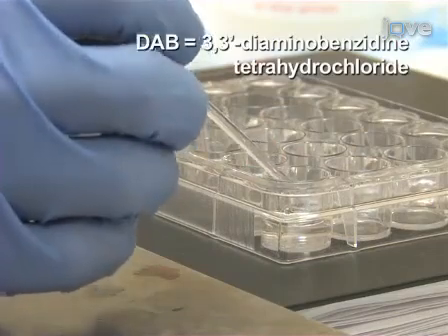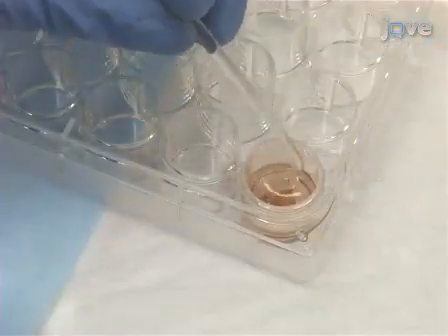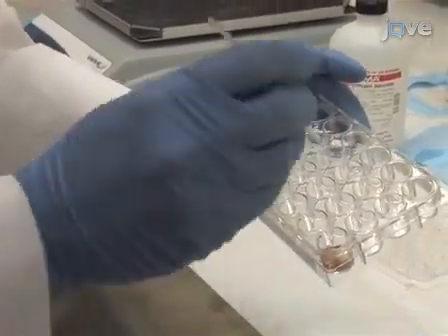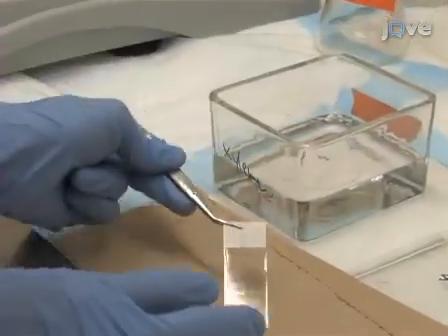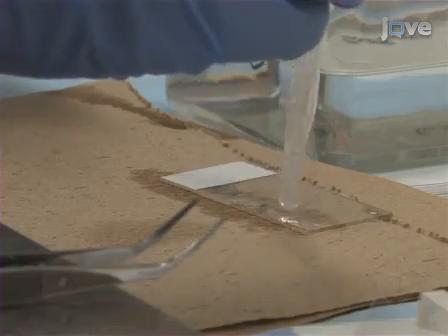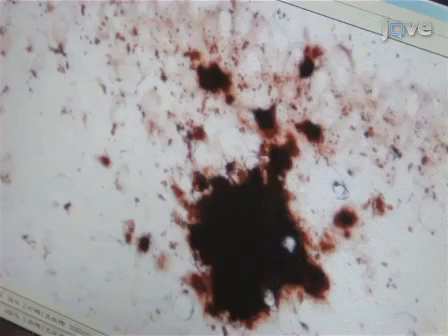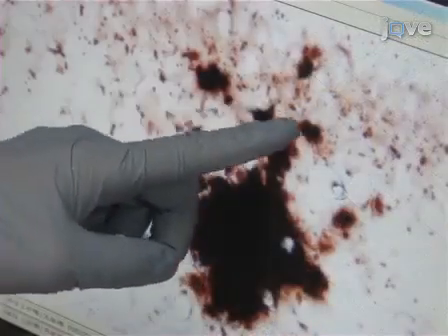Incubate sections in freshly prepared DAB mixture for 5 to 10 minutes. When a brownish color develops on each section, wash 3 times with Triton X PBS for 10 minutes with gentle shaking. Mount the free-floating brain sections on gelatin-coated slides and air dry. Clear with a series of xylene treatments and mount in Entellan. Visualize the plaques under light microscopy at 40x magnification and quantify mean plaque count per slice for each mouse.